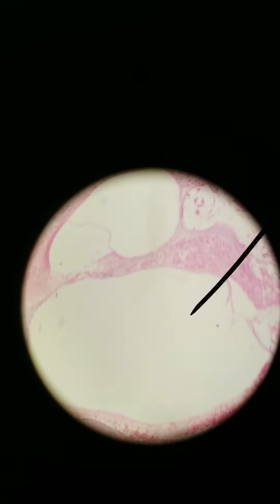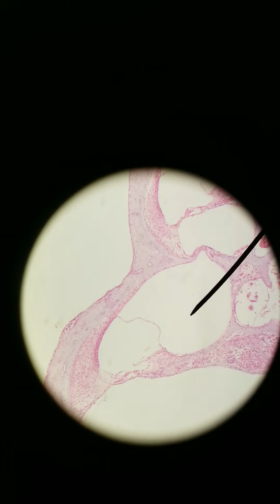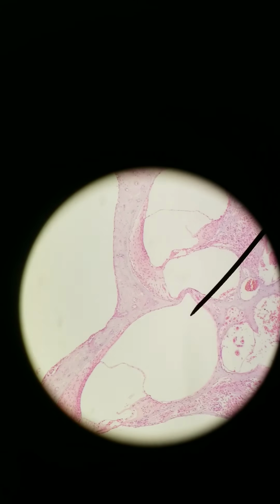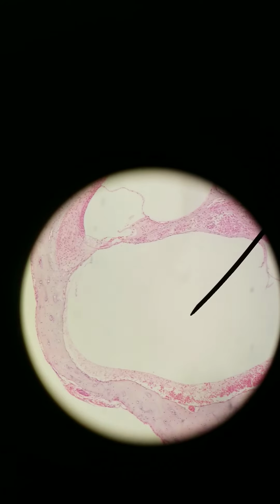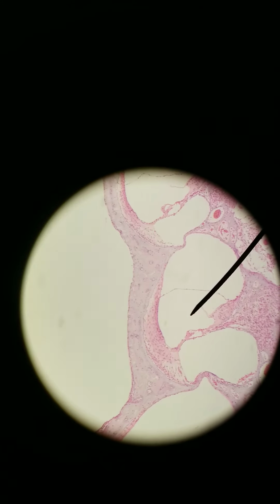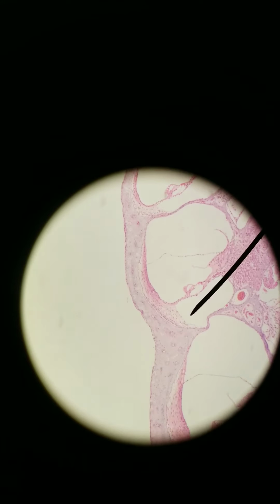Let's go a little closer. Let's go to 100x. This is scala vestibuli, media, tympani. And this repeats: vestibuli, media, and tympani. Vestibuli, media, tympani.